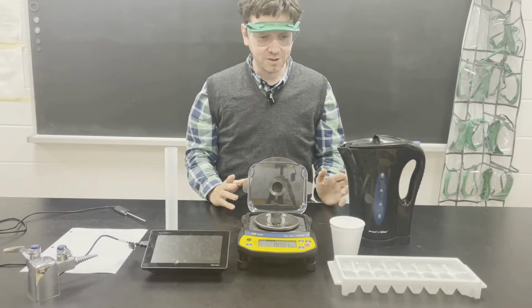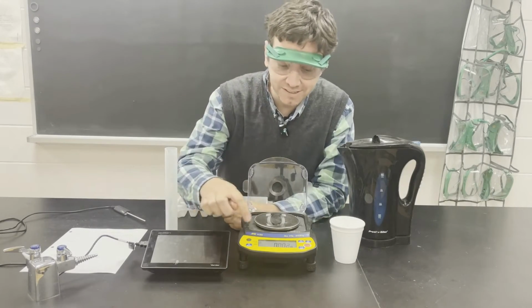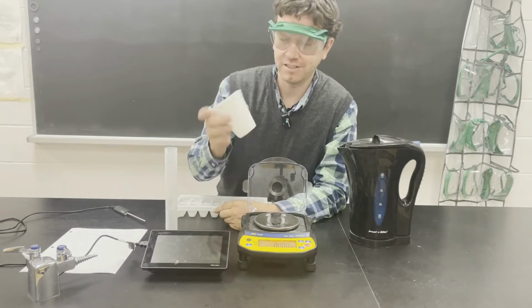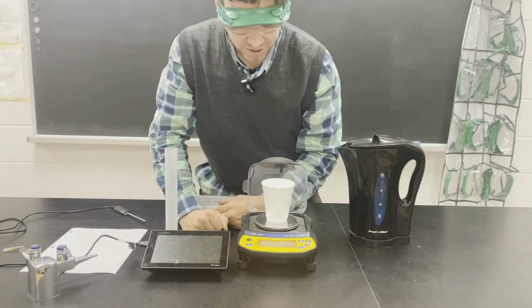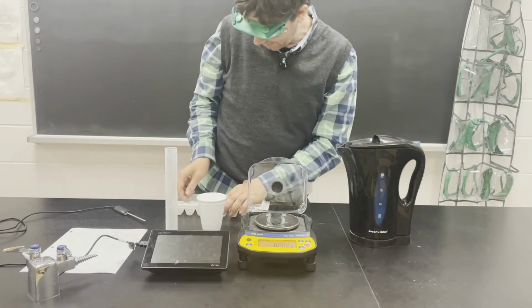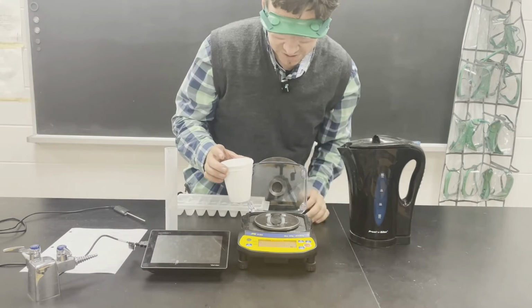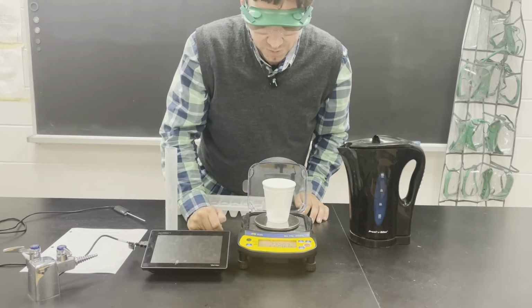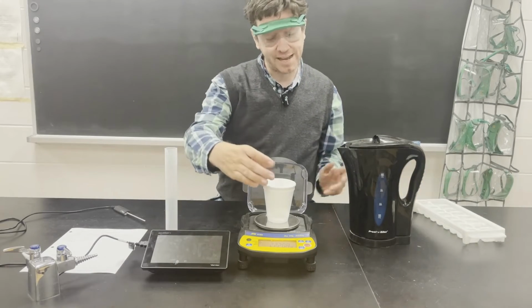Now, first thing we're going to do is to figure out the mass of one of our ice cubes. So we're going to zero our scale here. And first, we have our styrofoam cup that we'll be using. So let's figure out what the mass of the cup is. So we've got 2.577 grams. And then let's take one ice cube, put it in the cup, and we'll re-zero. Weigh them both together, and we have 22.207 grams. So you can subtract those two measurements to figure out the weight, or the mass, of the ice cube.